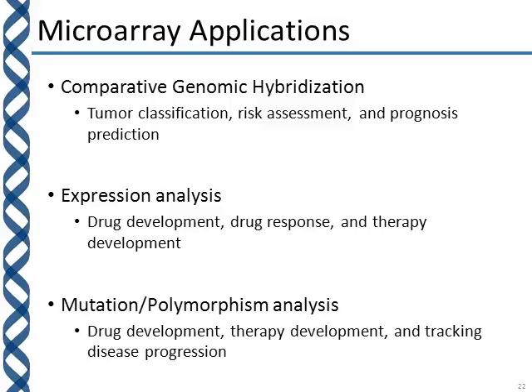So we can use these microarrays for different applications, such as comparative genomic hybridization. This allows us to classify tumors, for risk assessment, and to predict prognosis.